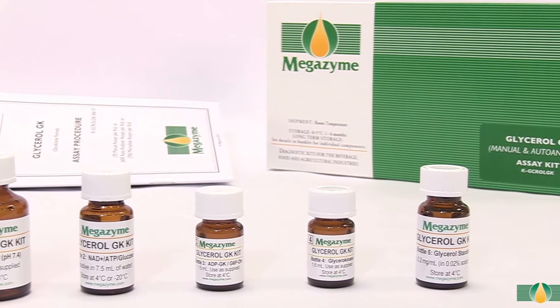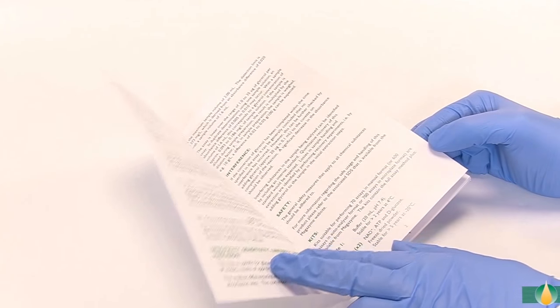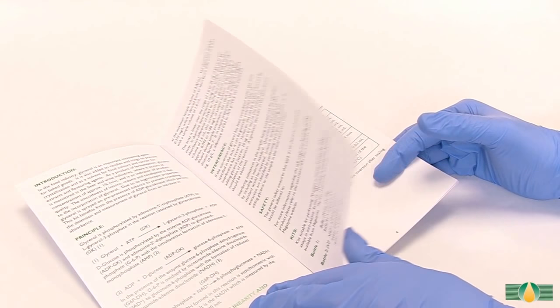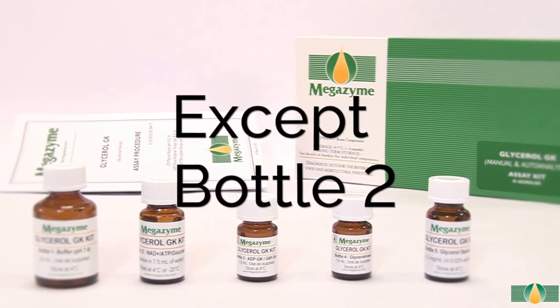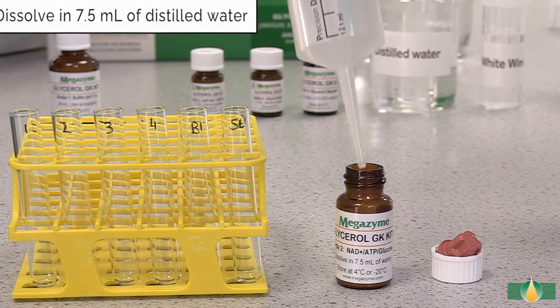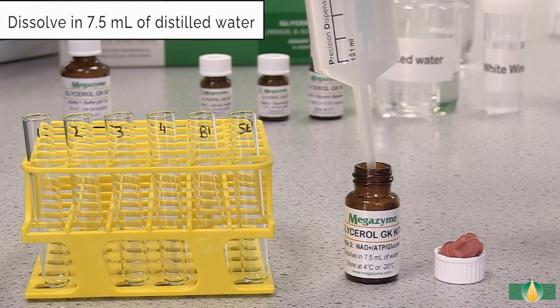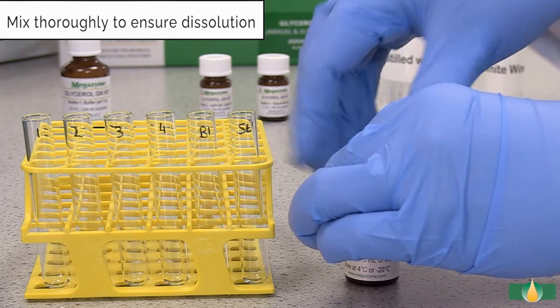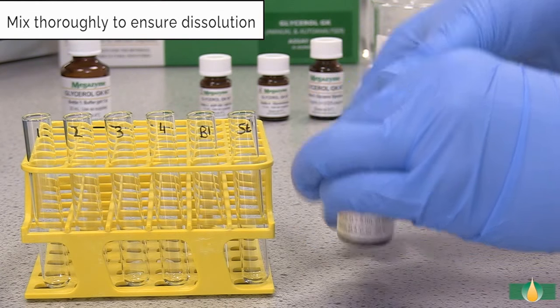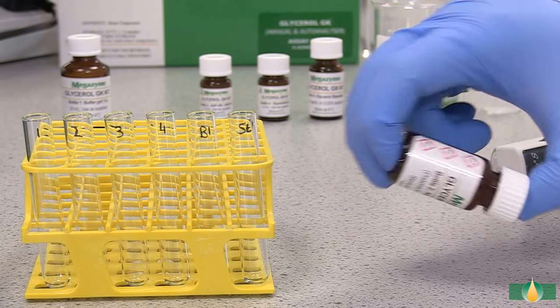Prior to sample analysis, the kit components should be prepared as described in the kit data booklet. Once prepared, they are ready for use in the manual assay procedure. All of the kit components, except bottle 2, are used as supplied. The contents of bottle 2 are dissolved in 7.5 millilitres of distilled water. The bottle is capped and the contents are mixed thoroughly to ensure complete dissolution. For longer term stability, do not dissolve the contents of the second bottle until required.